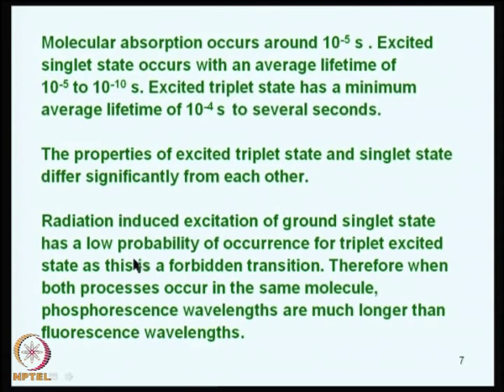Molecular absorption occurs in around 10⁻⁵ seconds, and the properties of the excited triplet state and singlet state differ significantly from each other. The radiation-induced excitation of the ground singlet state to the triplet excited state has low probability of occurrence, because the triplet excited state is usually a forbidden transition. Therefore, when both processes occur in the same molecule, phosphorescence wavelengths are much longer than the fluorescence wavelengths.